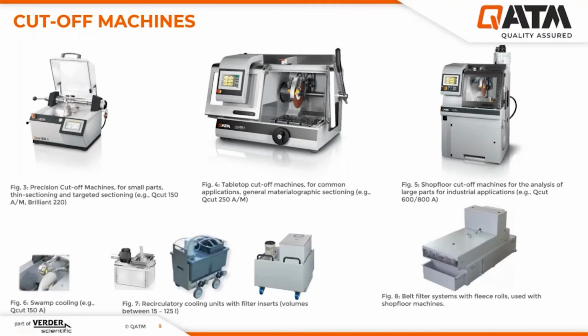Since we are talking about wet abrasive cutting, we of course need some sort of medium circulation, and there are different approaches. Especially precision cutoff machines sometimes sport a swamp cooling, which is quite interesting for thin sectioning processes. And here we see an image of the QCut 150A. However, more common is the use of so-called recirculatory cooling units, which are in principle a basin with a pump and a filter insert. Their volumes can range between 15 and 125 liters.